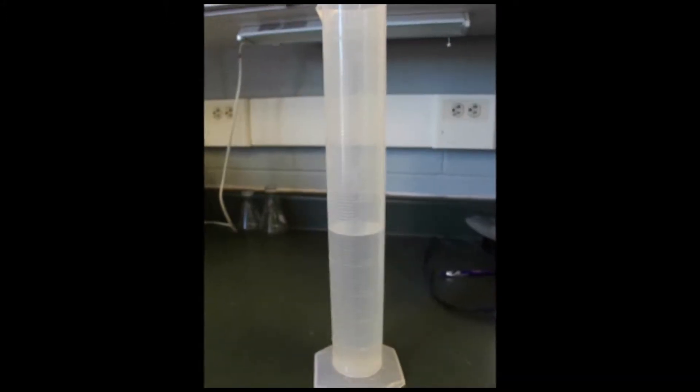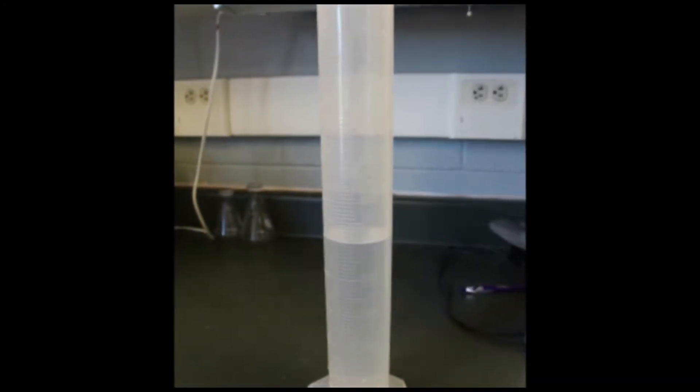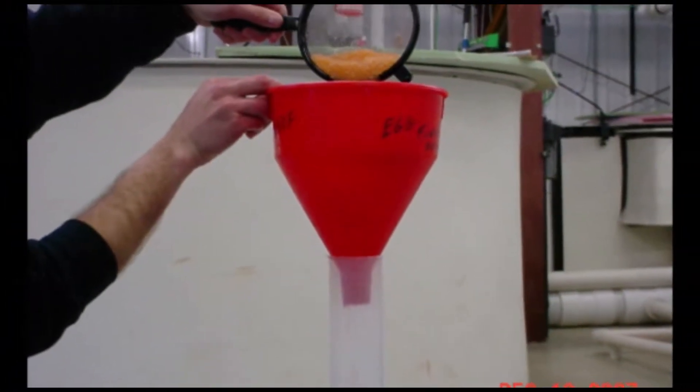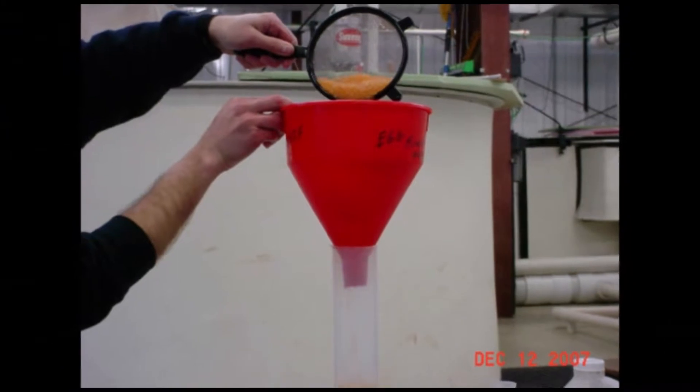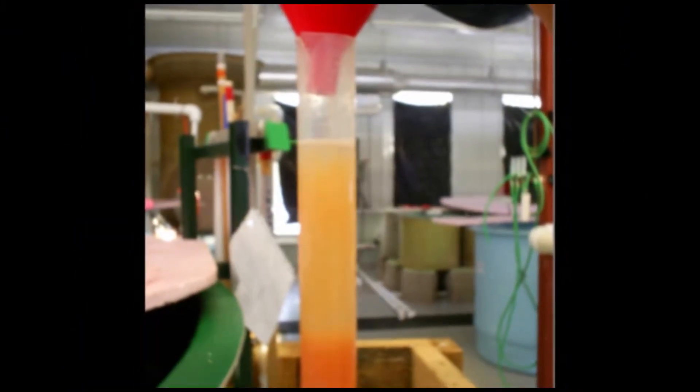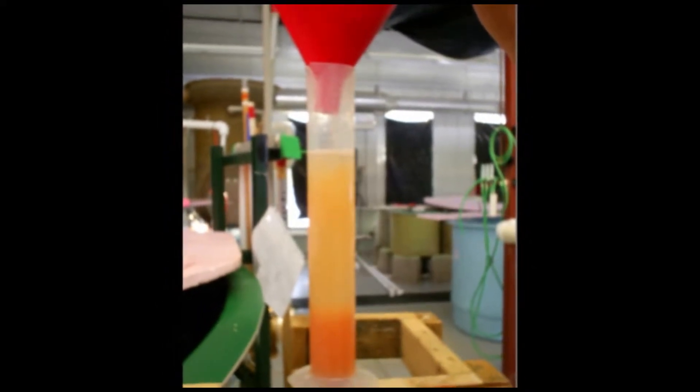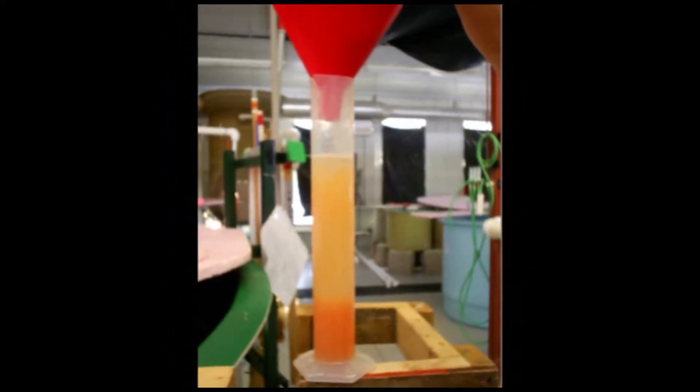This method involves filling a large graduated cylinder with water about half way to a known volume. The eggs are strained and funneled into the graduated cylinder of water. Make sure that all the eggs placed into the cylinder are submerged in water. This may have to be done several times depending on how many eggs are being quantified.